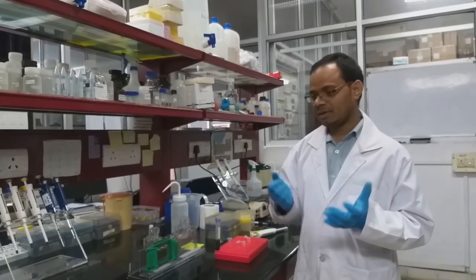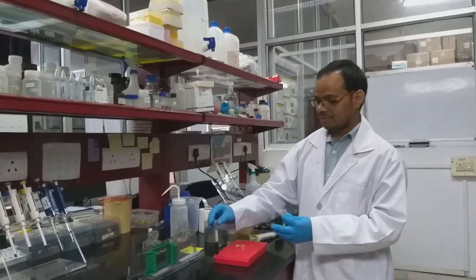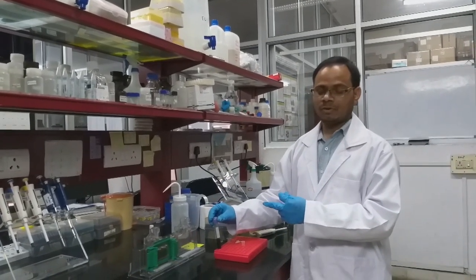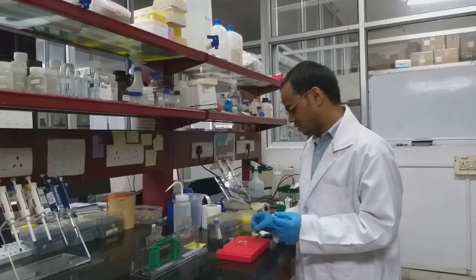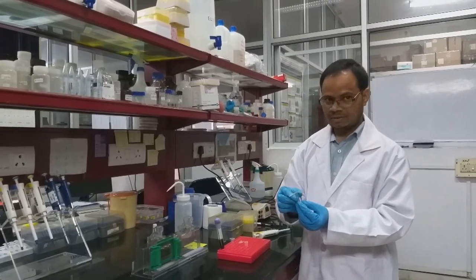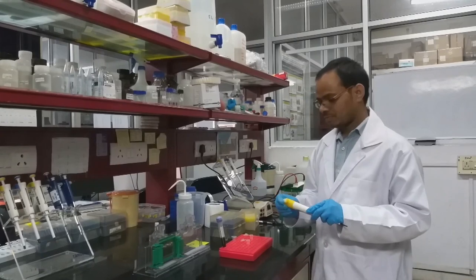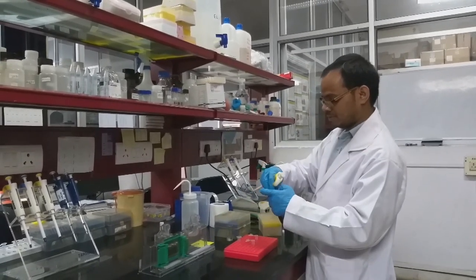So this is the loading time. We have to take the protein solution. Here we already prepared a 10x loading dye. We have to prepare 1x to mix with the protein solution. So this is 100 microliters of loading solution. We mix 10 microliters of loading dye into this protein solution.